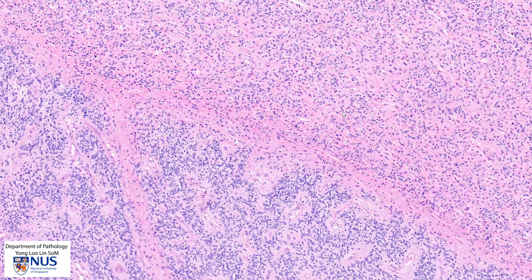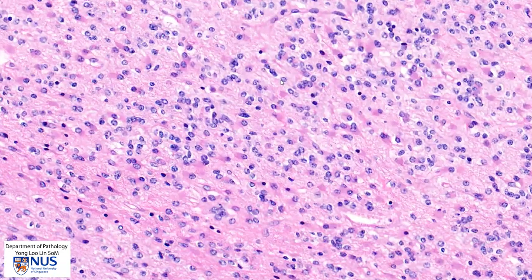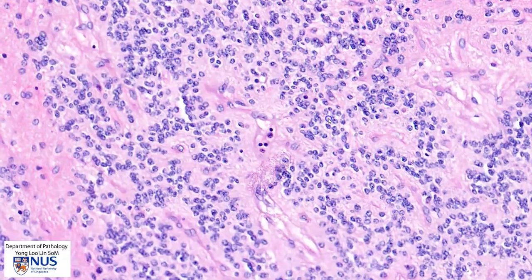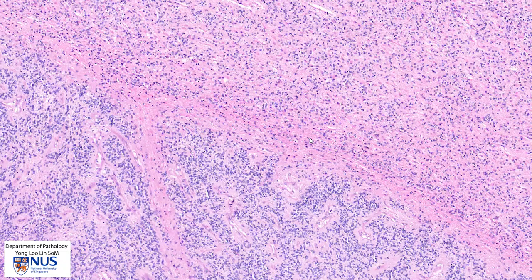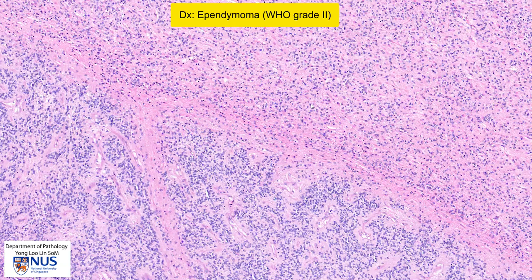In summary, we have here a low-grade glial tumor comprising round to oval cells with very uniform nuclei containing speckled chromatin, showing some perivascular pseudorosettes. There are no features to suggest a high-grade tumor, such as necrosis, nuclear pleomorphism, or mitotic figures. This is therefore a low-grade, WHO grade 2 ependymoma.